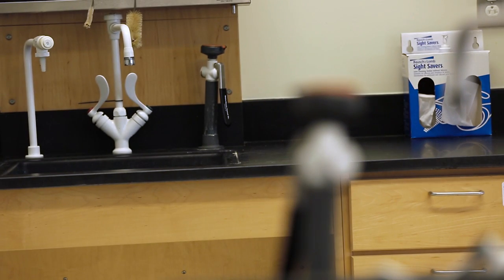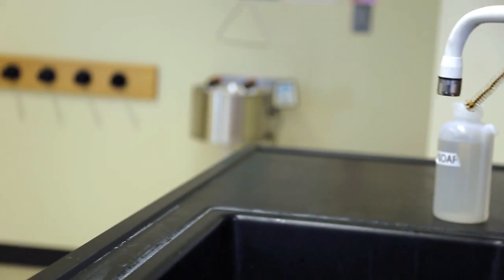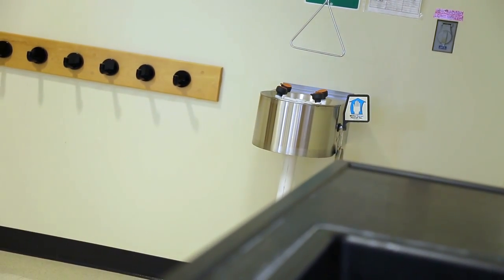An eye soaker is located at every sink in the lab. These are easily accessible and should be used immediately until someone can assist you to the main eyewash station.